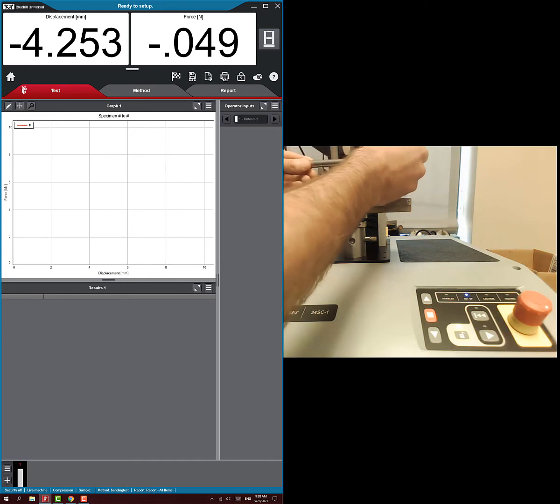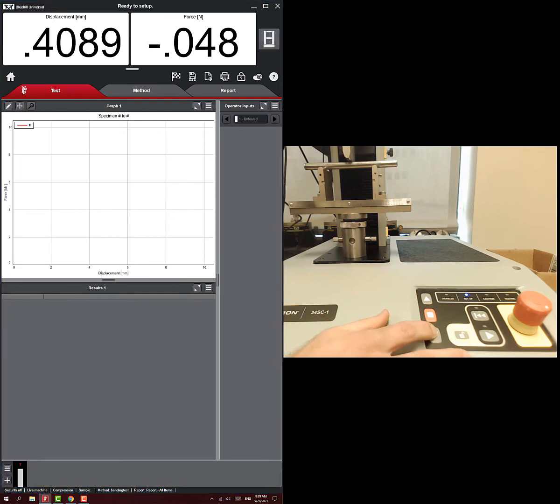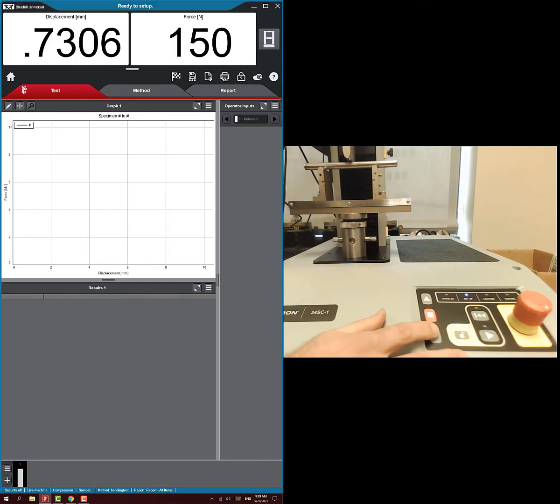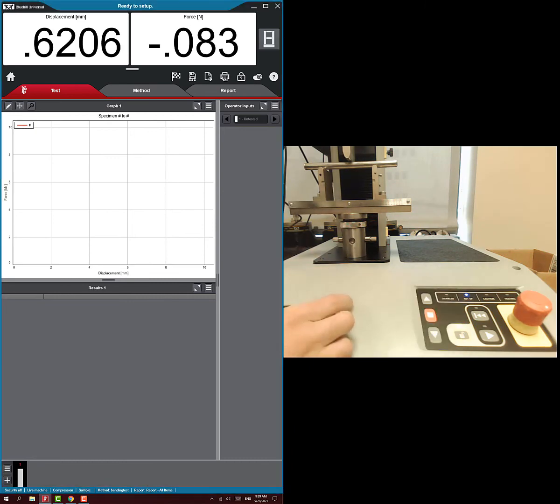Now make sure the crosshead is set up so it's just touching the steel beam. I'll watch the force on screen and slowly lower the crosshead very gently until it just touches. When it touched, the force jumped up to 150, so I'll come up just a little bit off of that — right where it's just ready to start.